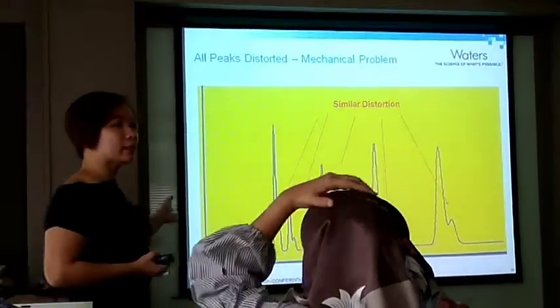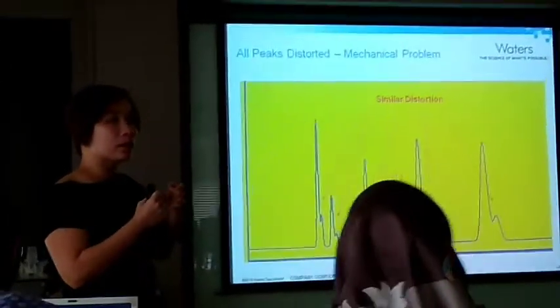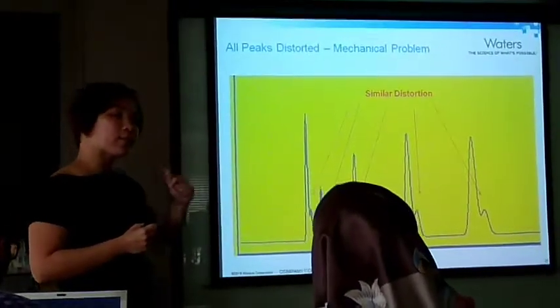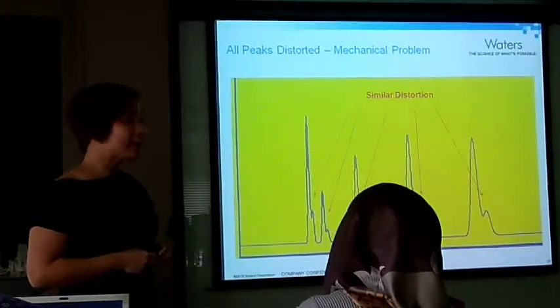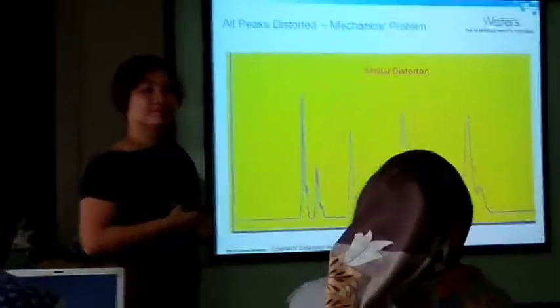This is mostly due to mechanical fault. That means a connection problem, or there's a void in the system. Is it common here? Similar distortion.